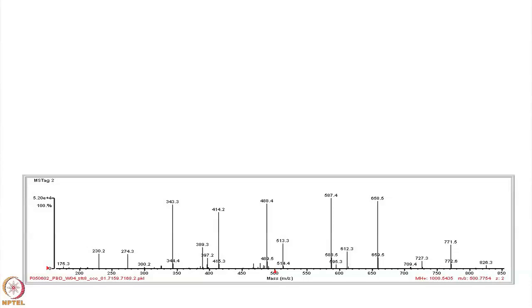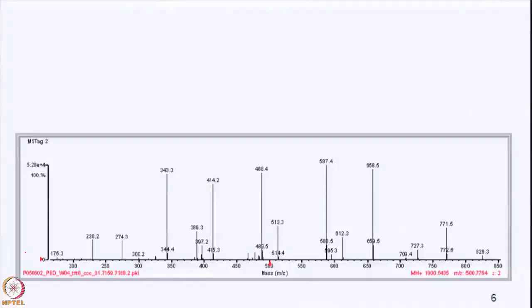If you're looking at the spectrum, this is where the precursor mass is, and you can see that there's some symmetry. These two peaks are about equidistant from the center, and that means they're probably a B-Y pair. So I'm just gonna do this kind of thing here. Then I bet if you look where the red carrot is. The other thing you can do to check if you can't really tell the symmetry is add up the masses. 414 plus 587 should be equal to 1,001.